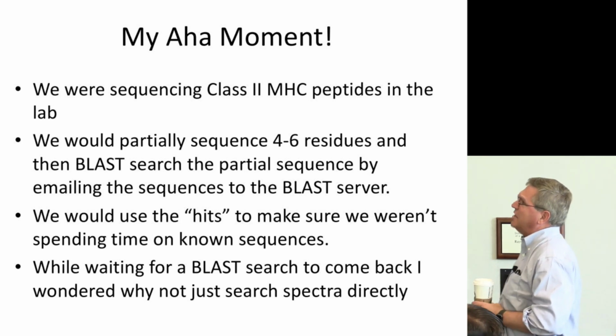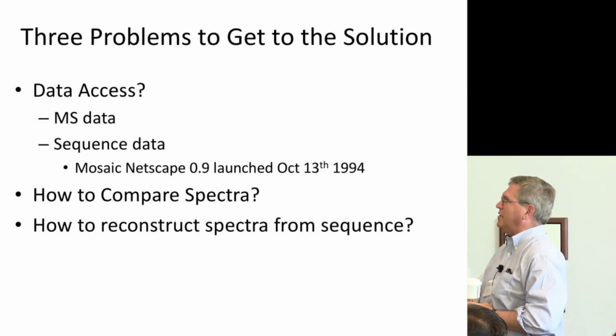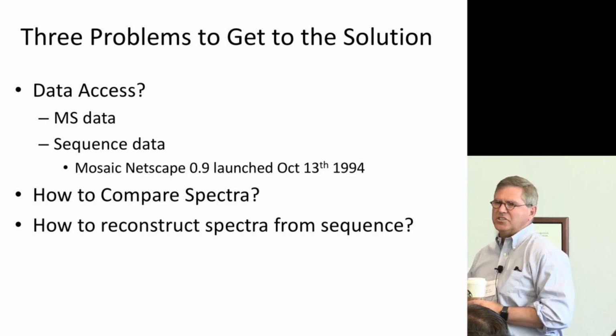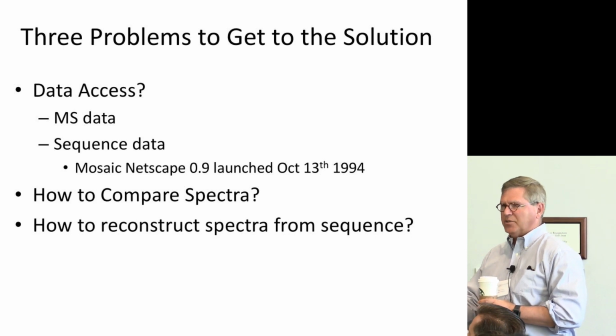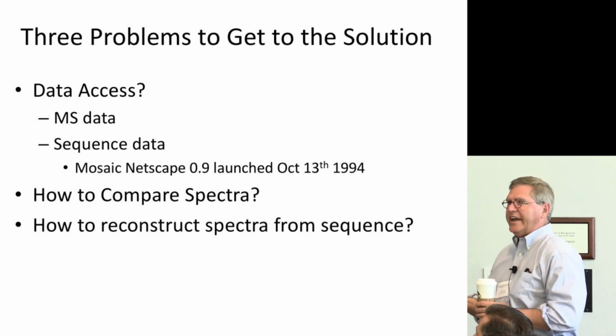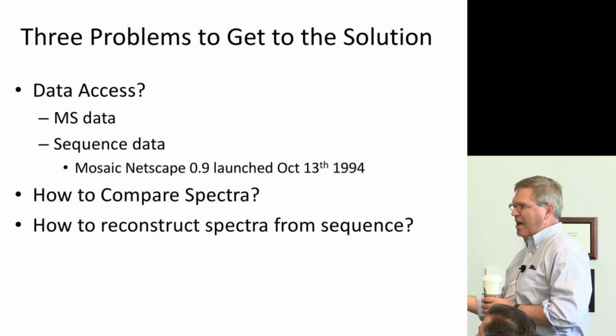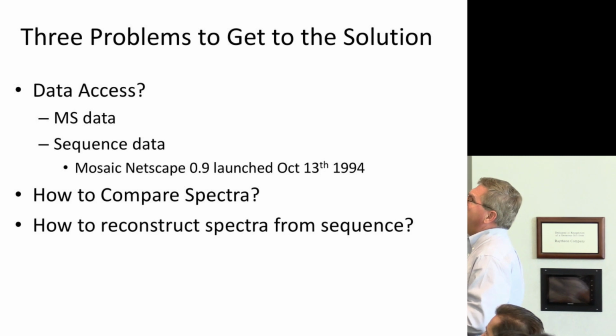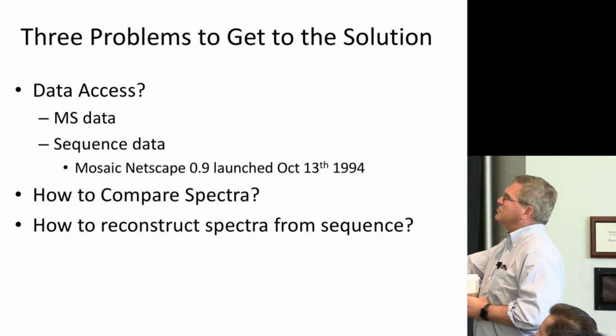So we had to access MS data. That's like now, it's in a binary format, a proprietary format. And it's actually a federal regulation that the data has to be in a proprietary format. You can't access it. You certainly can't take data out, modify it, and put data back into the file. That's a big no-no as far as the FDA is concerned.